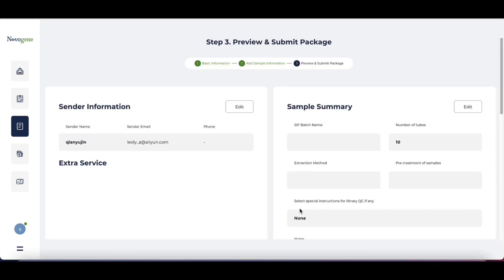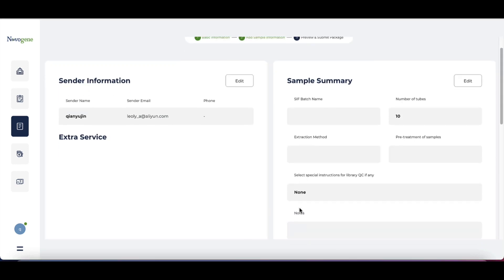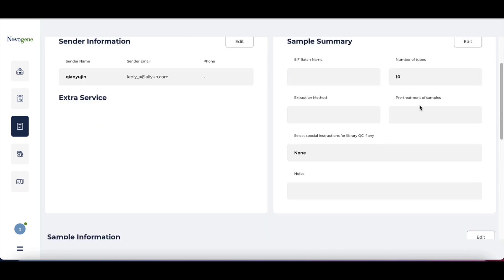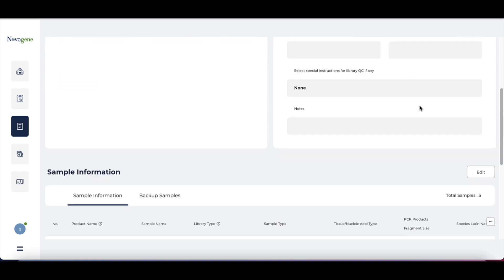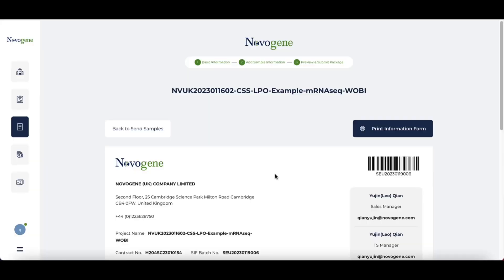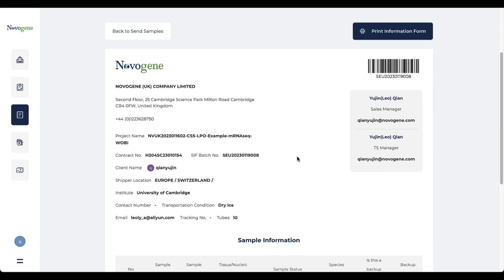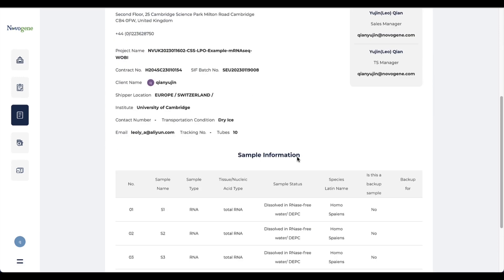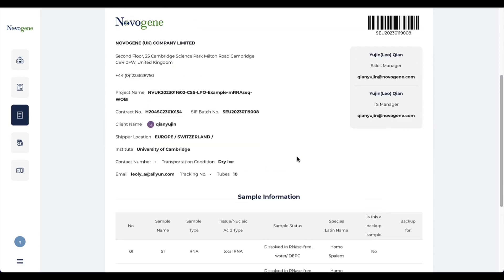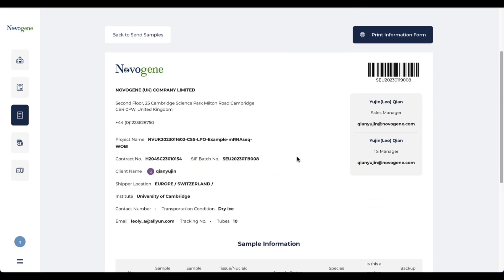The last step is the final review. Please check if all information is correct. Continue will lead you to a print page. Please print this page and attach it to your package. The sample collection team will associate your sample to your contract based on the information on this sheet. Therefore, receipt of a package without the sheet might be delayed.